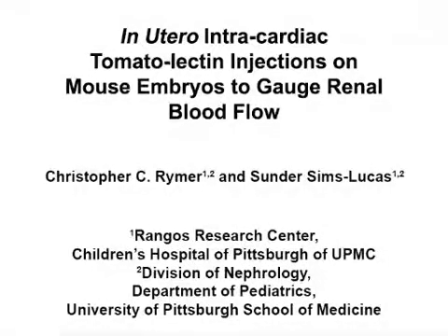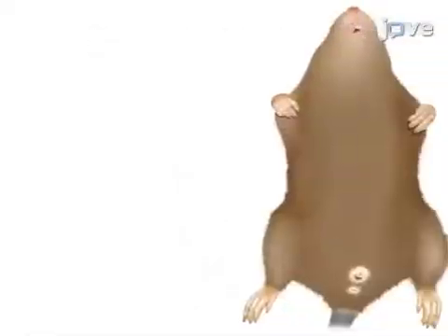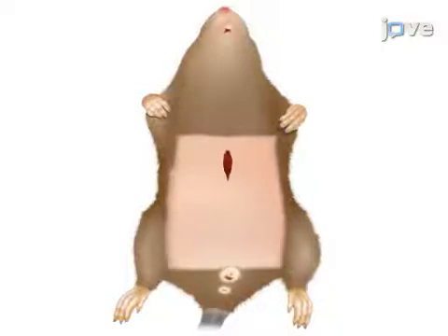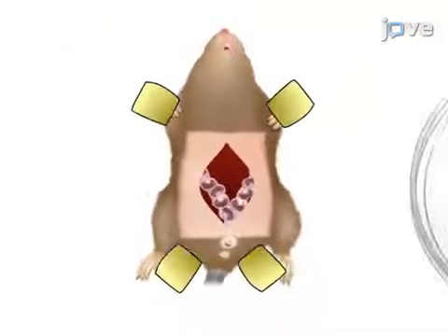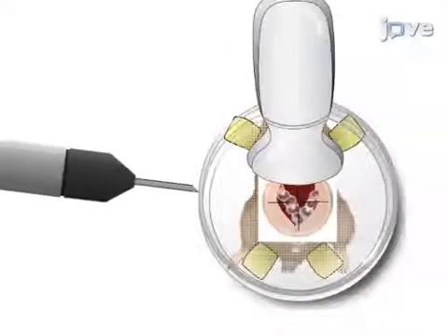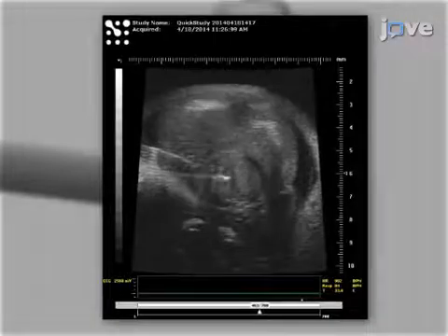The overall goal of the following experiment is to map the flow of blood in the embryonic kidney. First, an embryo is extracted from the uterus and prepared for an ultrasound-guided intracardiac injection. The embryo is then injected with FITC-labeled tomato lectin using ultrasound-guided microinjection.